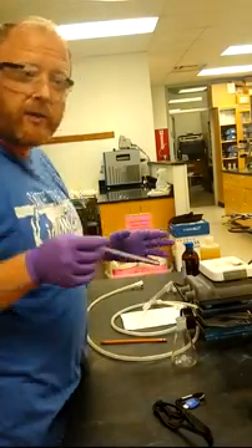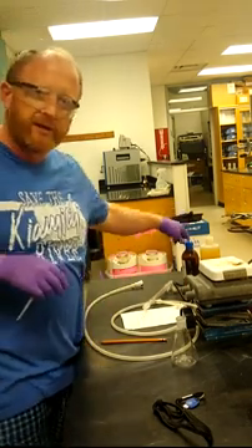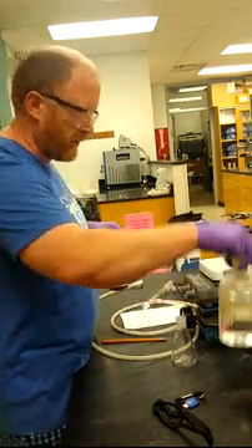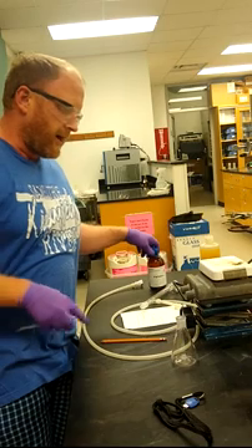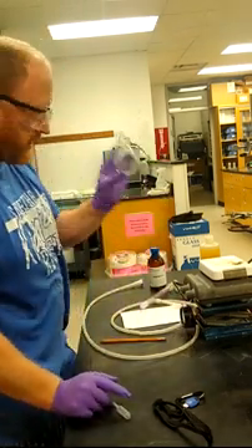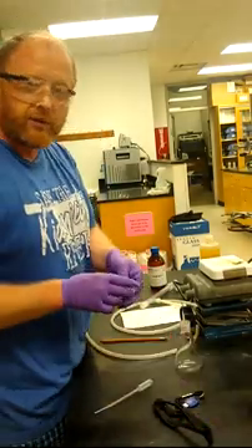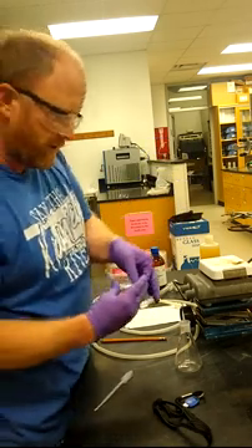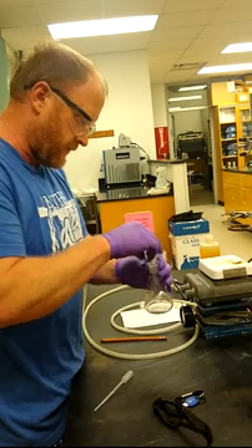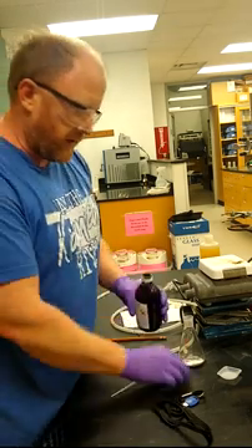For today's lab for the synthesis of aspirin, we're starting with salicylic acid and also using acetic anhydride and concentrated phosphoric acid. The procedure has you using a 100 ml conical flask and 2 grams of salicylic acid. I've already got that pre-measured, so we're just going to add that to the flask, and we're measuring out acetic anhydride.